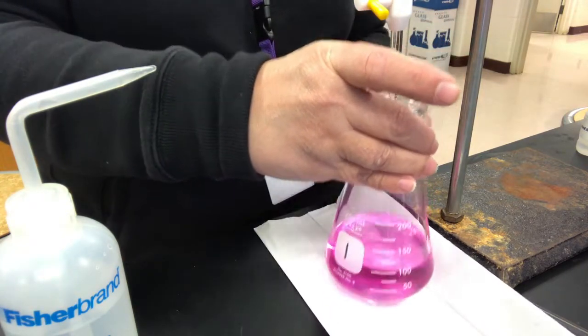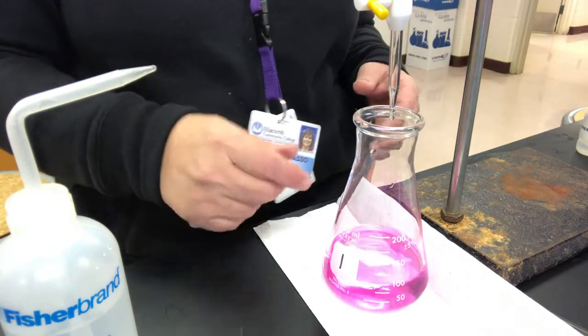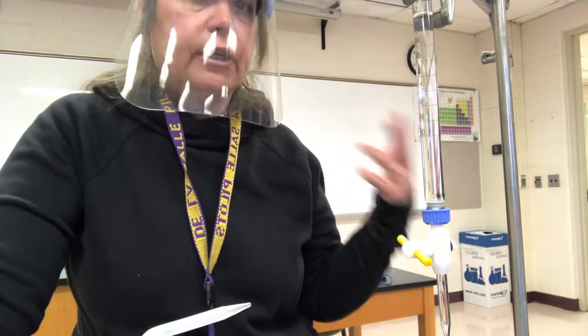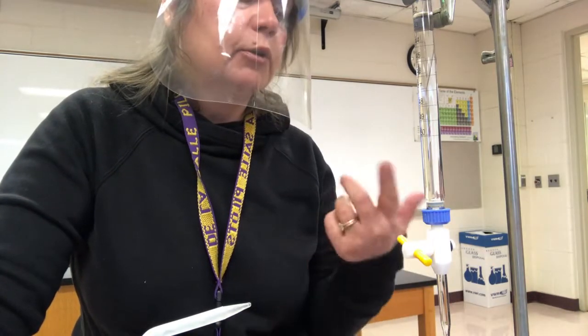Now what I'm going to do is the other 2 titrations because we do need to do this in triplicate. But you don't need to watch them again. You've seen a good one. So those, I will give you shots. I will take photos of the initial and final burette readings for you.